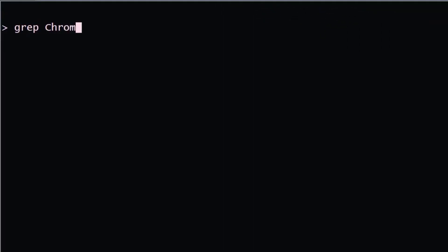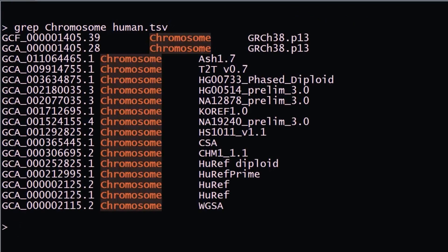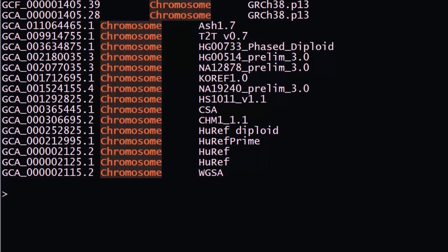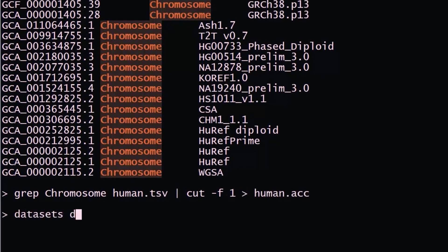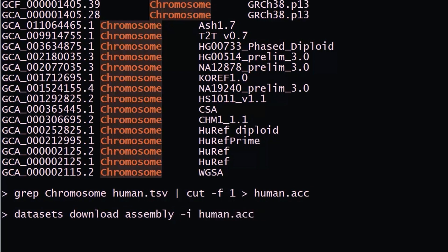This grep command shows you the assemblies for which Datasets downloaded chromosome information. Now we're going to customize the download. I'll first put the assembly accessions into a file, then use the command datasets download assembly and retrieve only chromosome 21 for our list of assemblies.